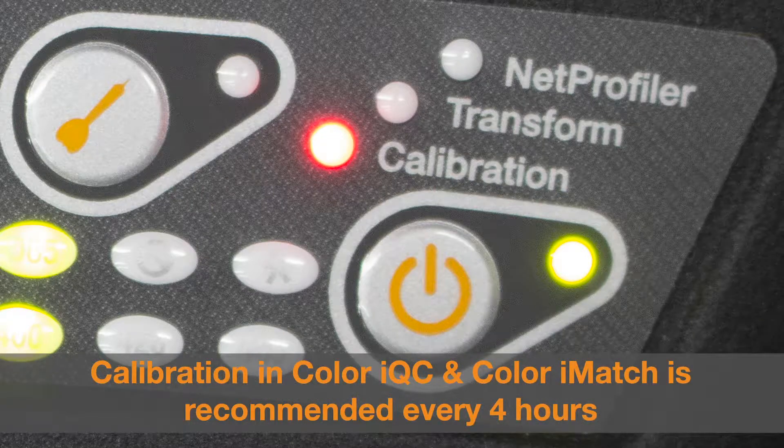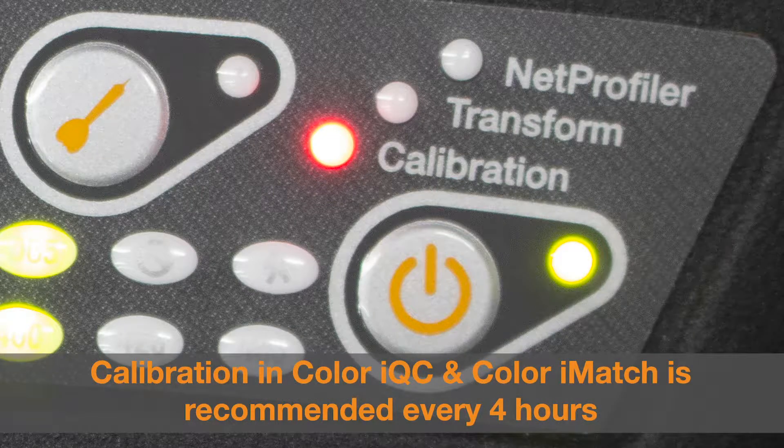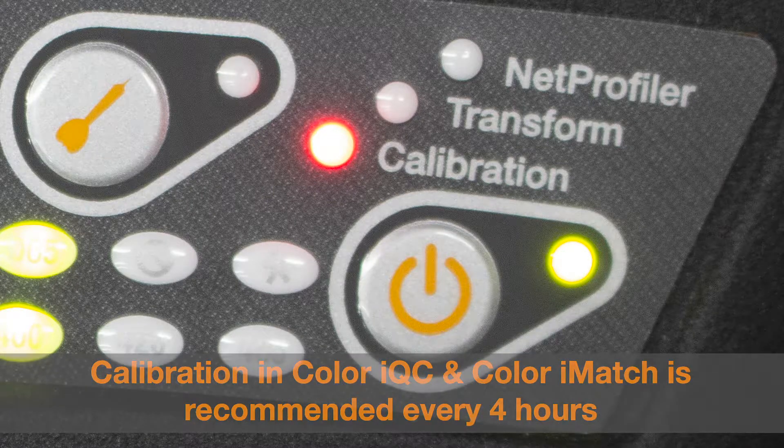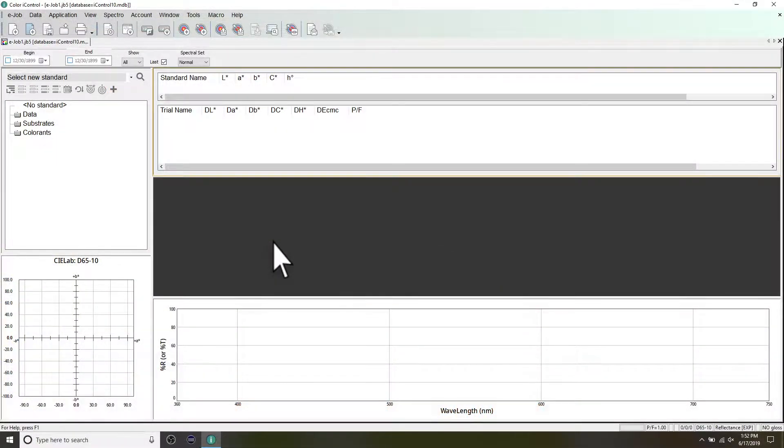The indicator on your instrument will appear red when your calibration is expired. In Color iQC or Color iMatch, the status bar will also show the remaining time of your calibration.